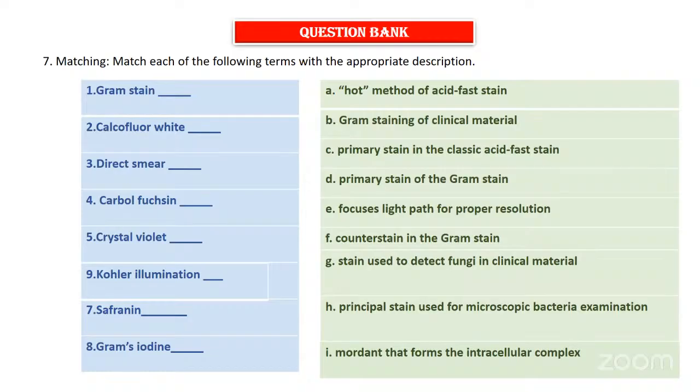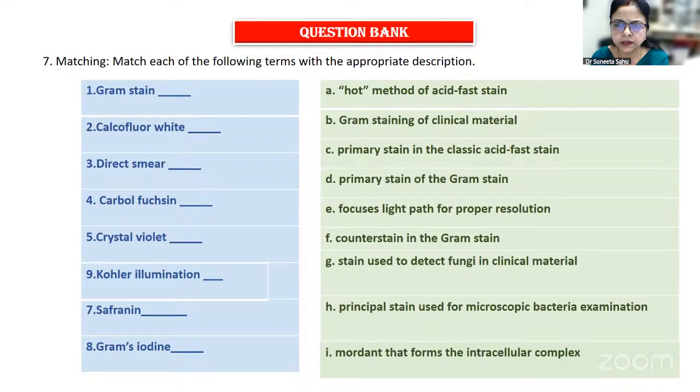How to interpret acridine orange means the microorganisms seen in the microscope, the different colors seen, orange, yellow. So how to differentiate the cells? It takes up the acridine orange, and it appears orange to the eyes. So that is how we interpret it, and we find it positive. It is orange color. It is positive.